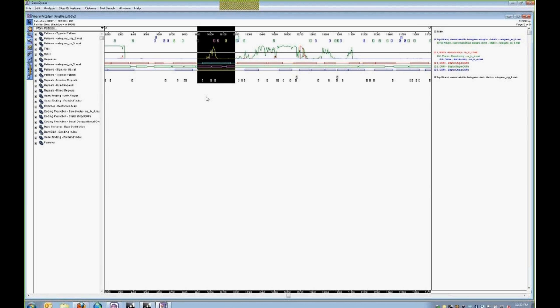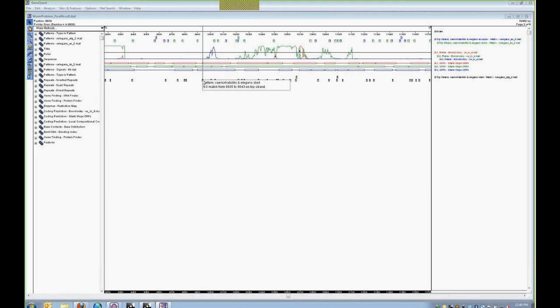The first thing you need to do is identify a potential start codon. So we have our start codons applied at the bottom here, and we have 3 that fit within this particular open reading frame. And if I click and hover over each of these, it pops up a score. In this case, we have a 9, we have a 6.6, and we have a 3.7.